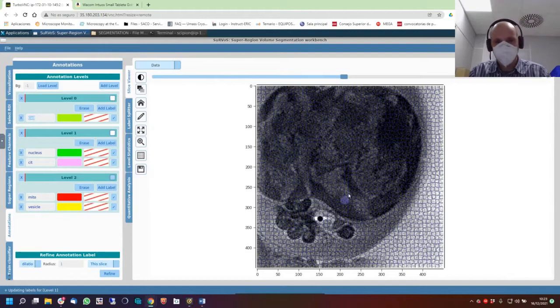How I prepared it here, this voxel can be assigned to 3 different labels, 3 different levels. You know what I mean? If I didn't create this structure, once I selected a voxel for a label, it could only be assigned to one, unless you create these levels. That's something you need to take into account.